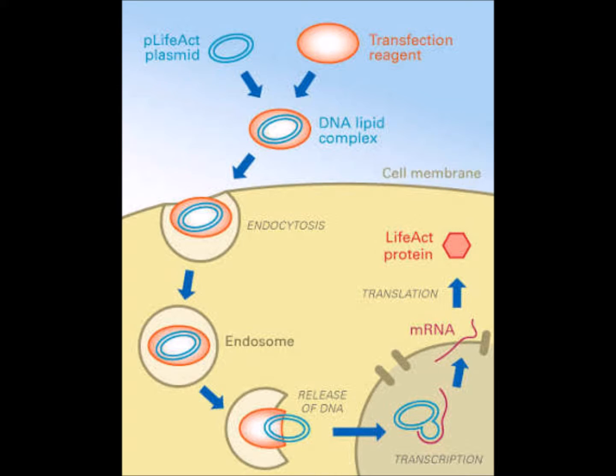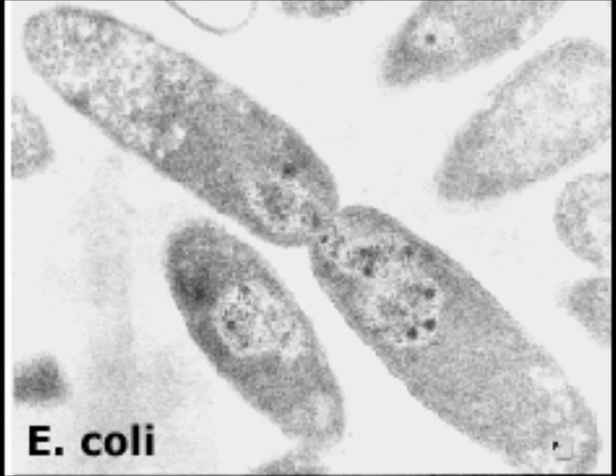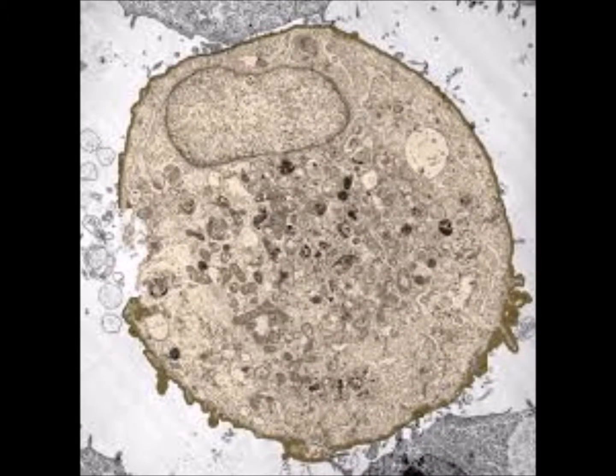The mode of gene transfer involves creation of pores on the cell membrane, enabling the cell to receive the foreign genetic material. The main difference is the organisms that are modified by these methods. Transformation is for prokaryotes and small organisms, and transfection for eukaryotes and particularly animals.